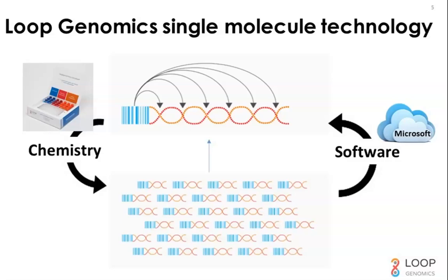We haven't taken a look at this question yet, but conceptually, a lot of what Tuval's assembly does is probably similar to the outputs of other synthetic long-read assemblers, in terms of providing coverage across those molecules that's consensus and high accuracy. But I don't know. We haven't played around with Athena specifically on LoopSeq data.